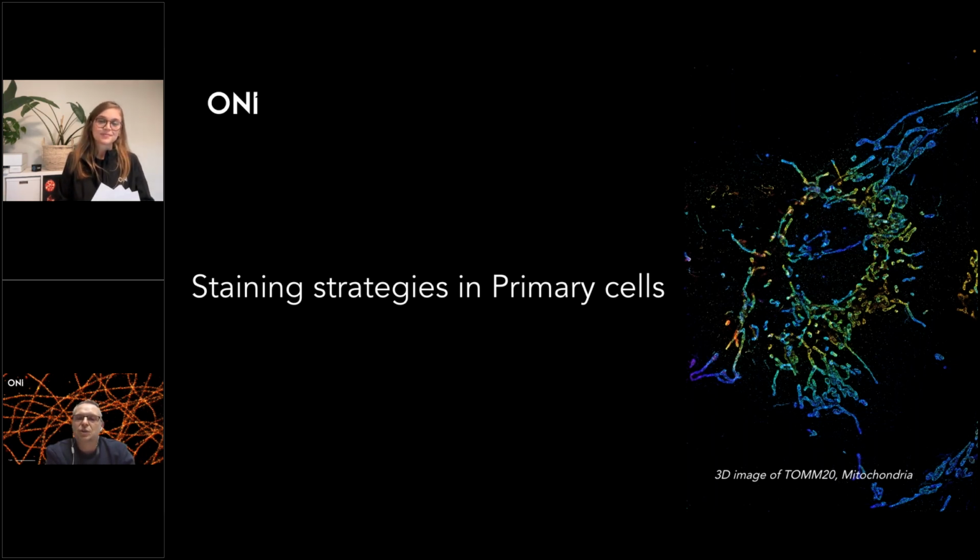Please make sure that your cells do not express Fc receptors. If they express Fc receptors, please do an additional blocking step with human serum, for example, if it's a human. This is very important, exactly.